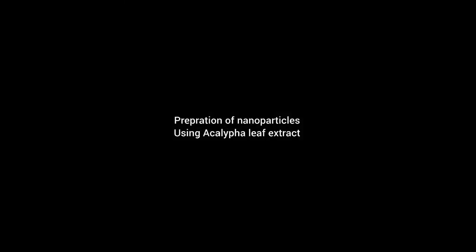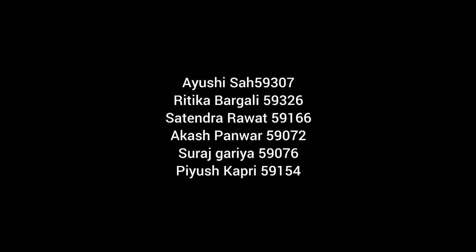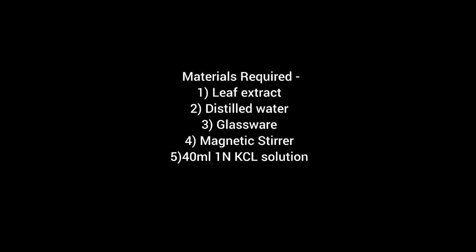Today we are going to perform the experiment of preparation of nanoparticles using Acalypha leaf extract. In this we are using the top-down approach. Firstly, the materials required are leaf extract, distilled water, glassware, magnetic stirrer and 40 ml 1 normal KCl solution.